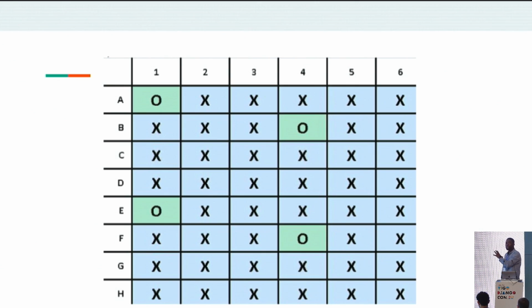So we have to follow some plating rules and regulations, like we have multiple samples from patients. If you look at well A1 and well B4, these are samples from the same patient. So we need to put 2 rows and 3 columns in between multiple samples from the same patient.